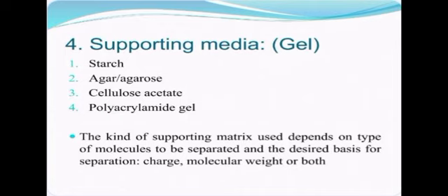In gel electrophoresis, we use a gel as the supporting media, and many gels are used. First, starch, agarose, cellulose acetate, and polyacrylamide gels. These are the gels we use in gel electrophoresis.